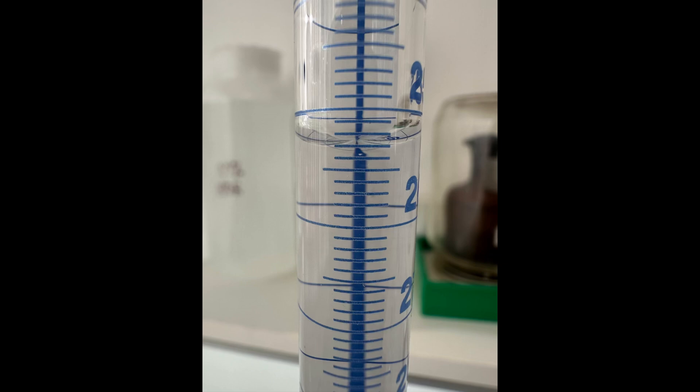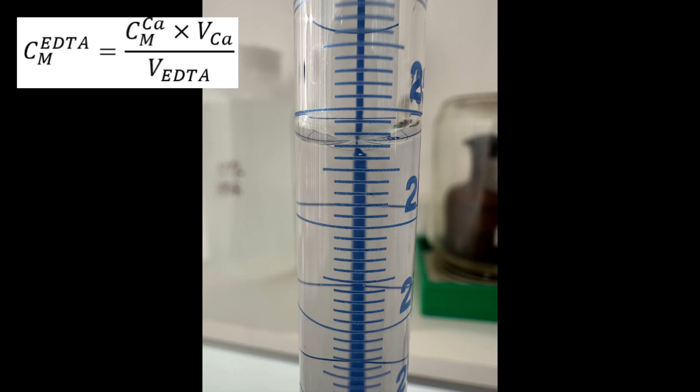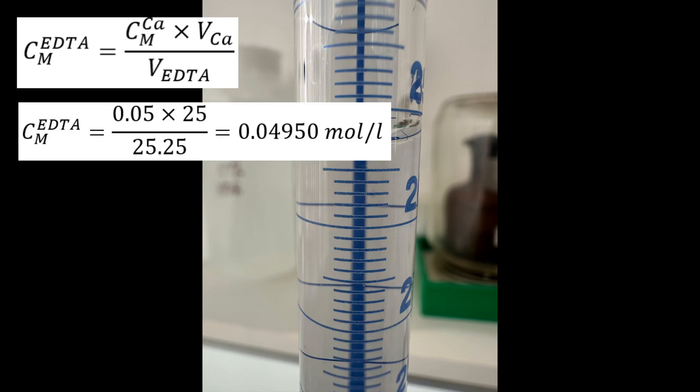To calculate the final concentration of the EDTA solution, we use the following formula. In the numerator, we have the molar concentration of the calcium solution times the volume of calcium solution used. In the denominator, we have the volume of EDTA solution used in the determination. When we replace the terms with the actual values, we get the result for the molar concentration of the EDTA solution.